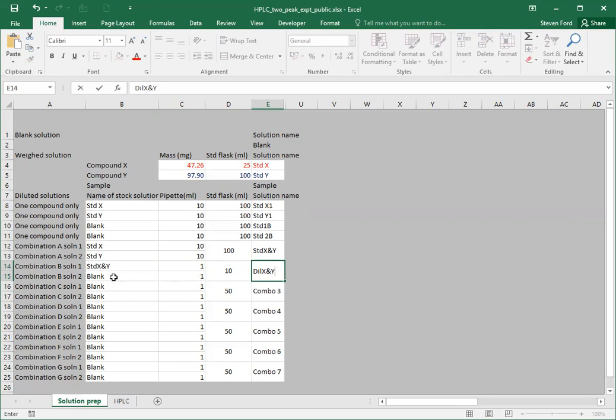So in this case, what I have done is, rather than combining the 2 solutions into one, I have combined my combination solution and a blank. So it's effectively perhaps only doing it once. Okay, that's fine. What I am going to do, actually, I said that I was going to leave these blank.